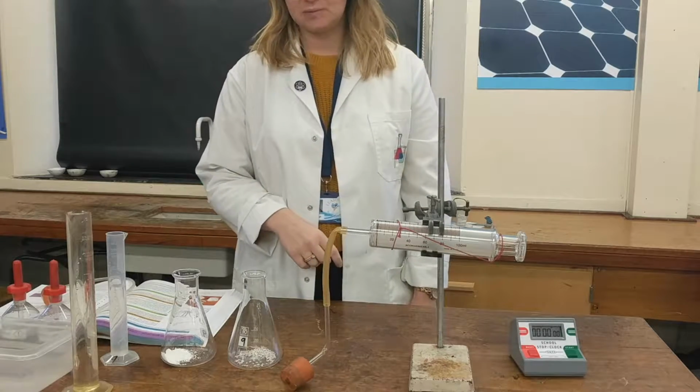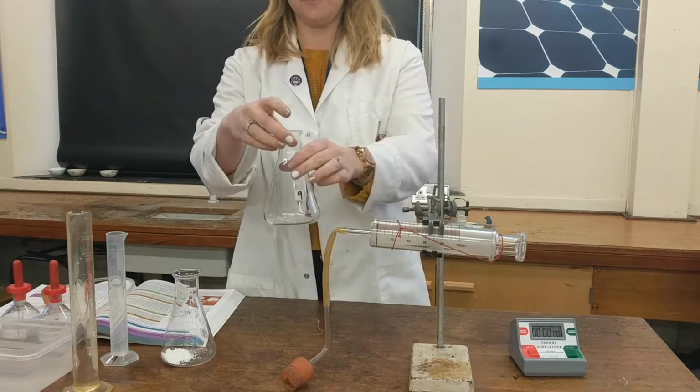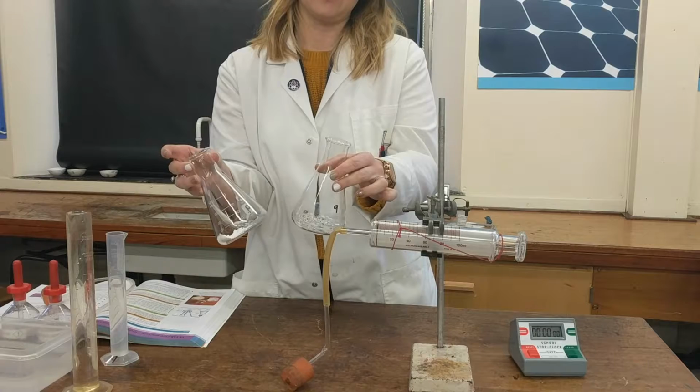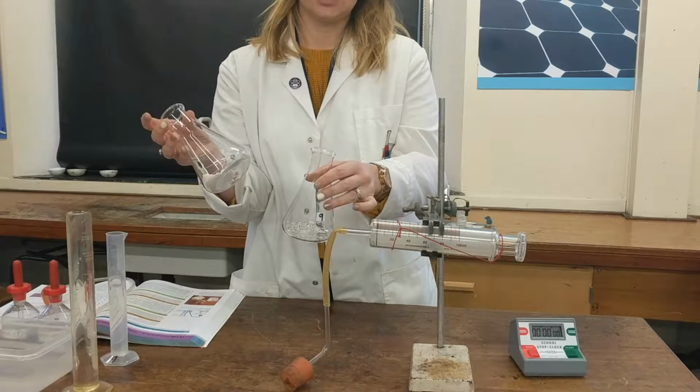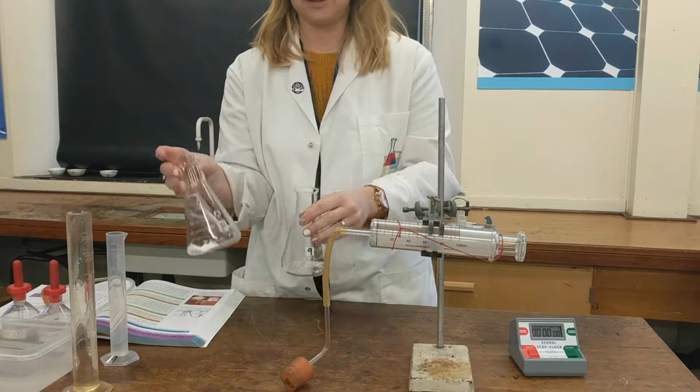The reaction is between some marble chips, some calcium carbonate, when they're in the chip form and when they're in a powdered form, because that will give them a different surface area. The powder has the bigger surface area than the chips. There is more surface exposed for the reaction.